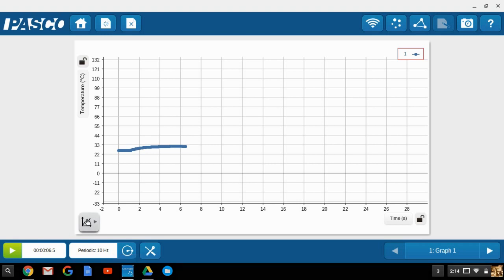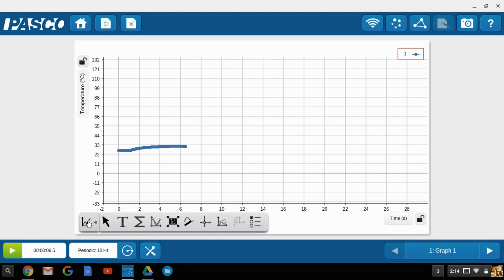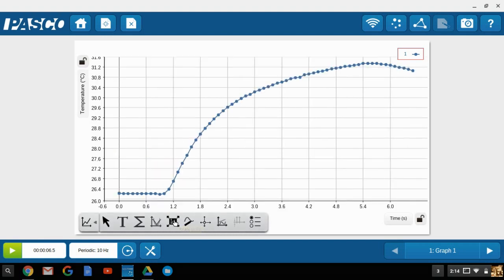To do that, I will click on the graph tools, and then I'll select the auto scale. This changes the display so that the data is spread over the entire graph area.